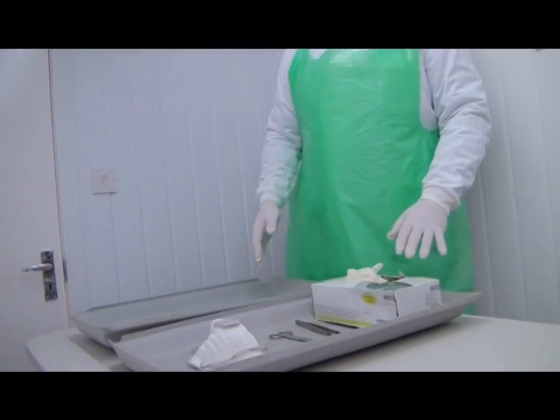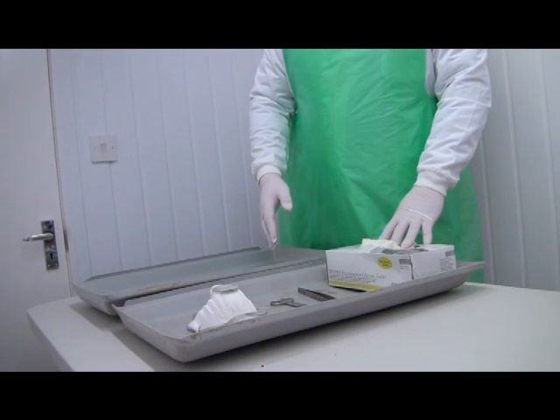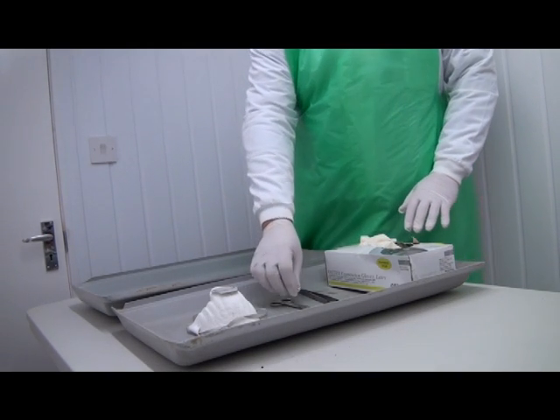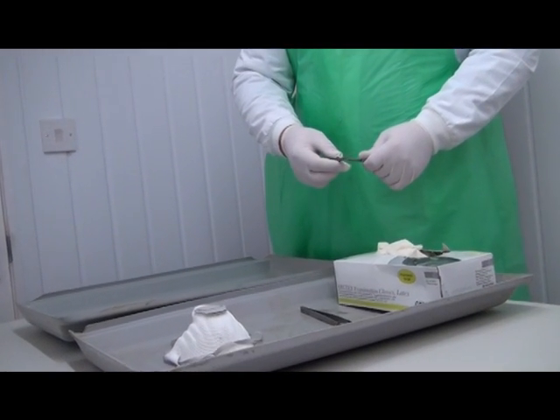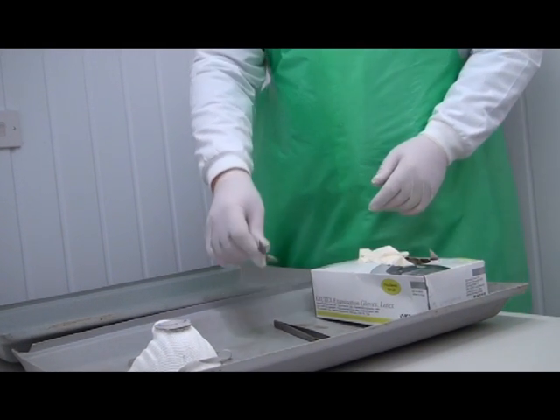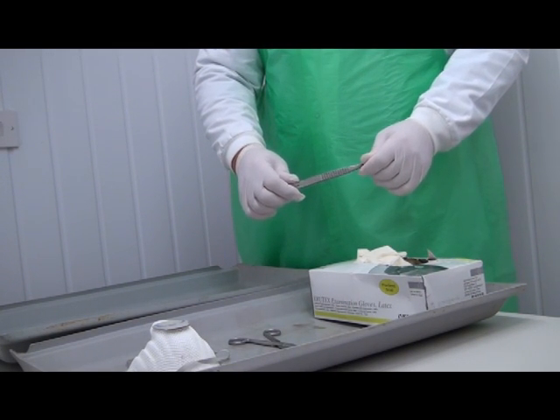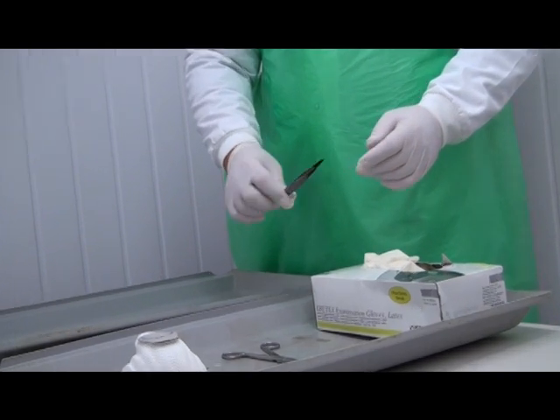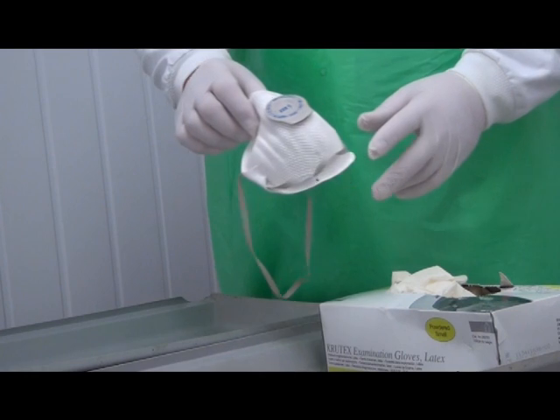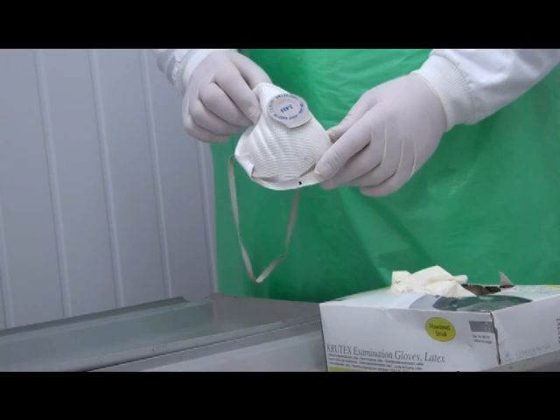opening the birds. In terms of equipment to perform the dissection, it's very simple. Gloves I've already mentioned, and if the gloves rupture, then you must replace them straight away. A pair of scissors, sharp scissors that will be able to cut through the skin easily, through the muscle and through the bone. I also use a pair of forceps in a post-mortem situation to help handle the tissues. It's also important for people that have allergies to wear a suitable mask that will provide protection.